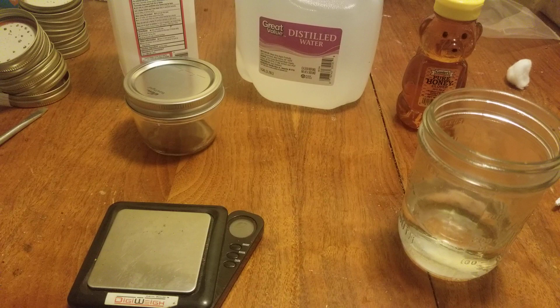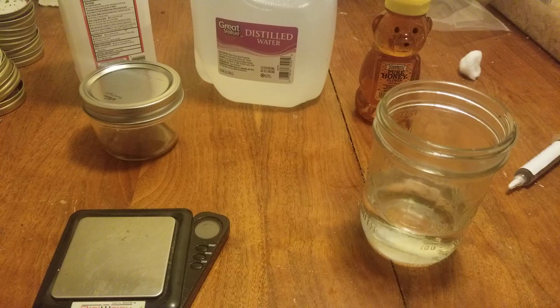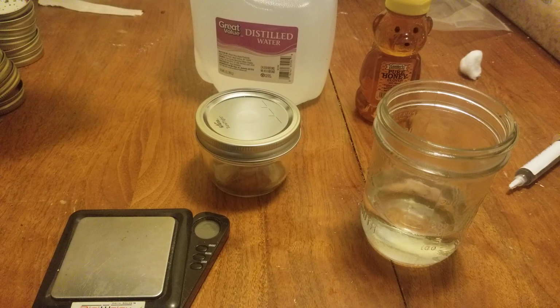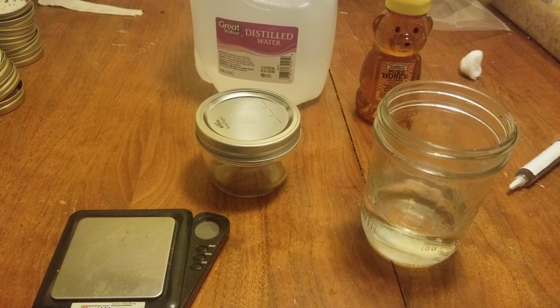So, what we're going to need to get started here is, of course, a jar. Of course, spores. I think that's it. Now, here comes the fun part. Of course, I'm using some isopropyl alcohol to sterilize my hands before I start jumping too far into this.